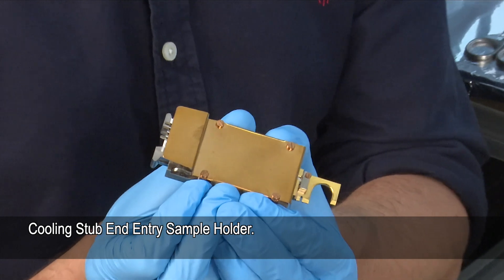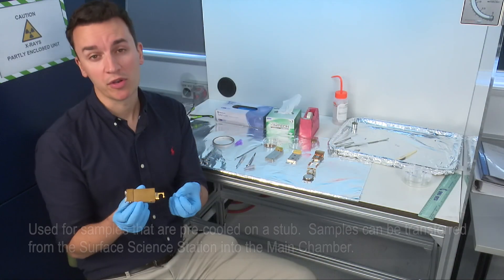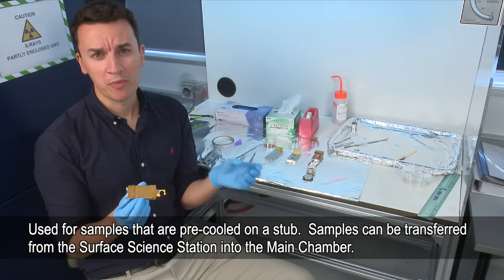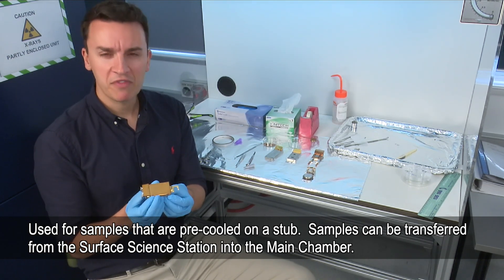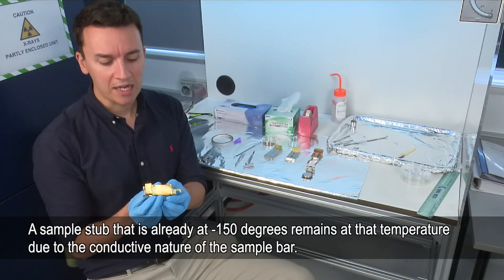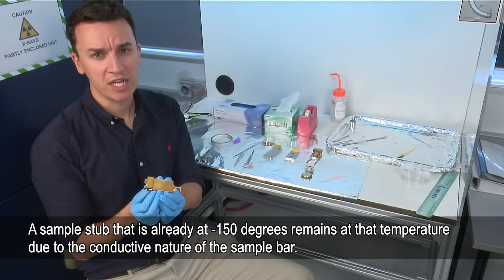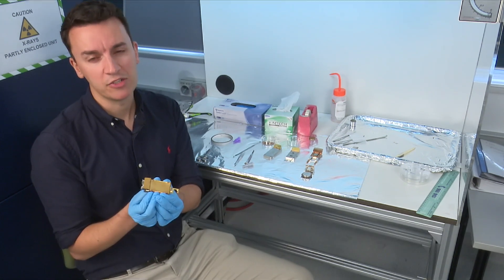This is another sample holder that we can use for cooling — it's for cooling samples that have already been pre-cooled on a stub when transferring them from the surface science station into the main chamber. With this we can add a stub that's already at minus 150 degrees and it keeps cool due to the conductive nature of the bar. This is just a variation on the stub end entry sample bar.